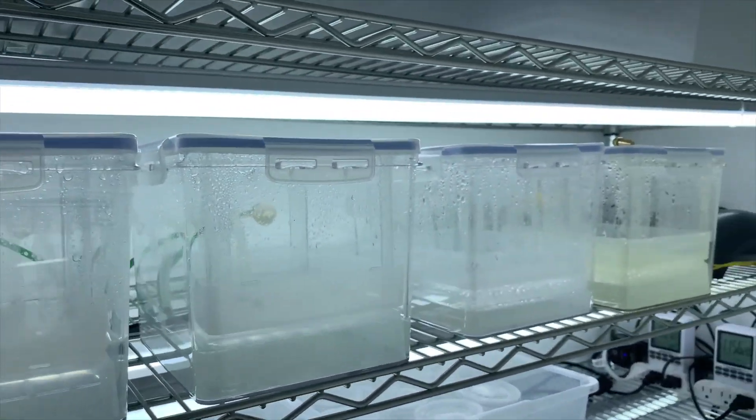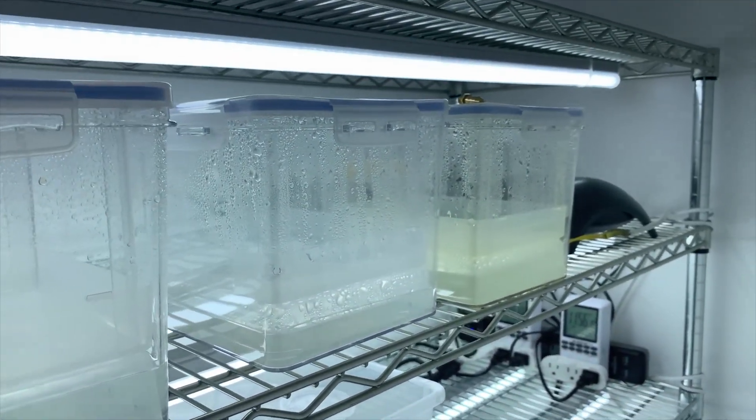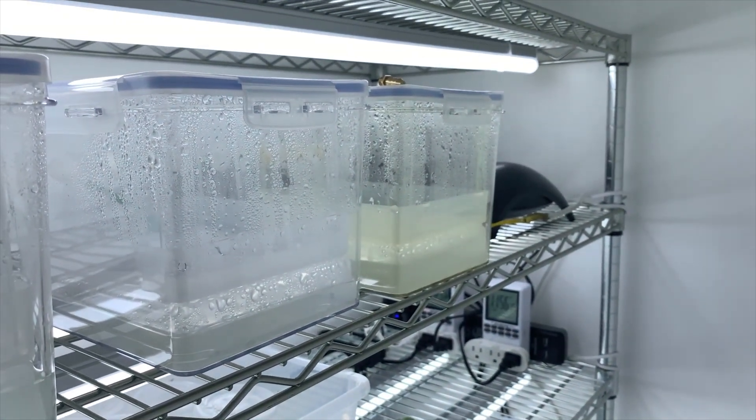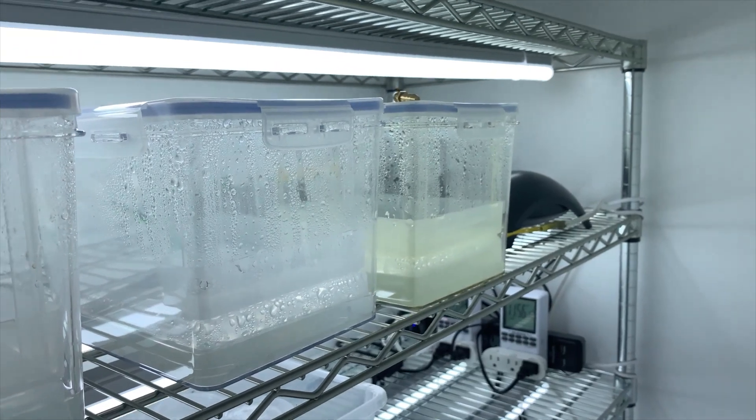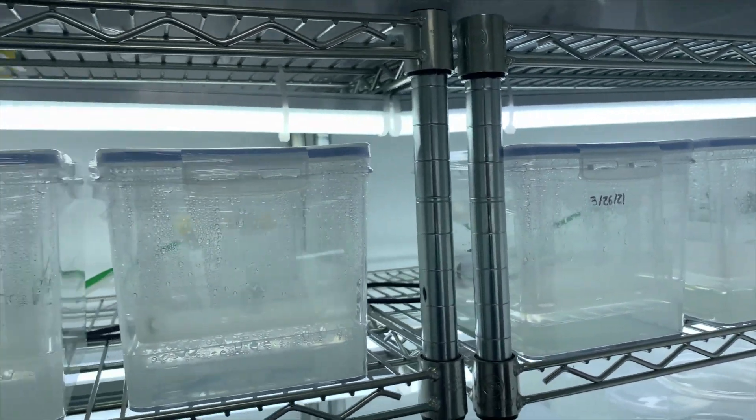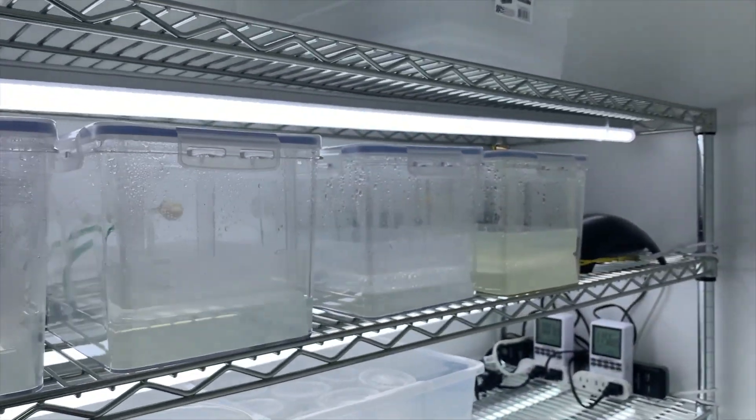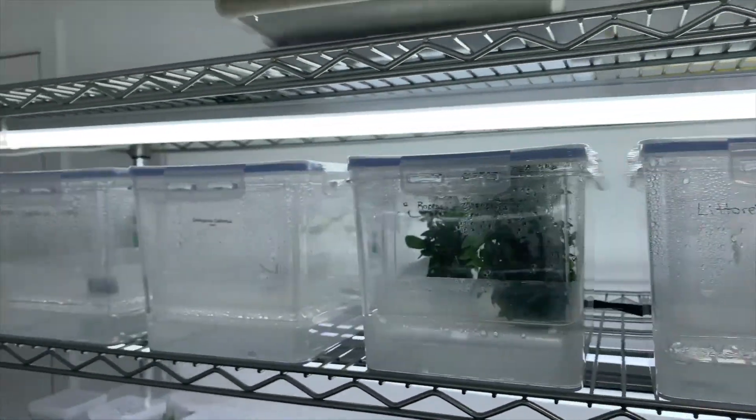And pretty much I still have two more temporary immersion bioreactors left. So let me know what plants you want me to work with next. And we'll see. After that one is done, I will come back to the first one.